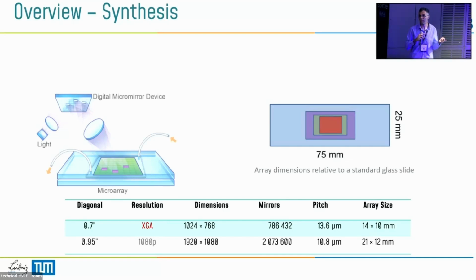Do you know, Erhard? I calculated once, to be honest. If we consider a DNA as a cylinder, we can calculate that number, but I guess it's roughly 1 million. But I'm not sure. I calculated once, yeah. So 1 million sequences of the same sequence at each of these spots.